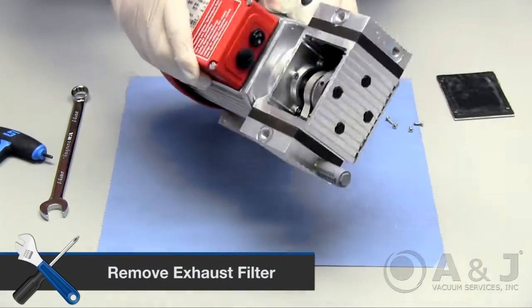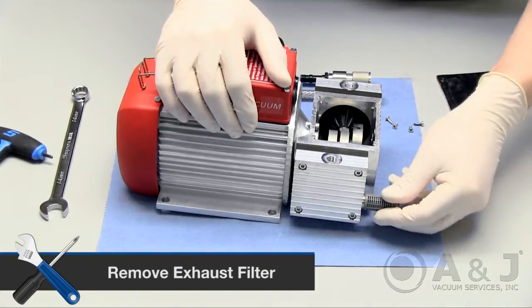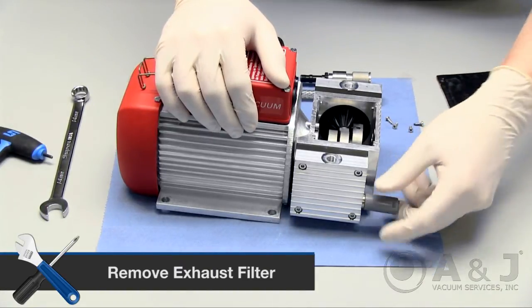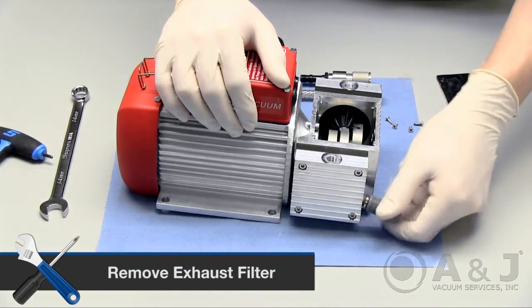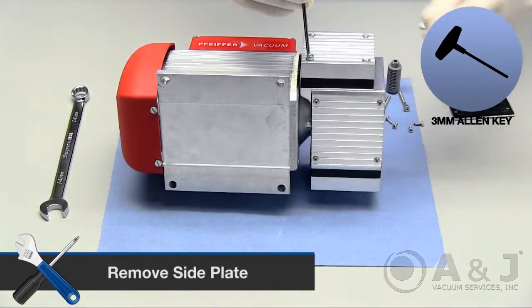Flip the pump over on its other side. Remove the exhaust filter simply by unscrewing it with your hand, and then remove the side plate by removing the four screws with a 3mm Allen key.